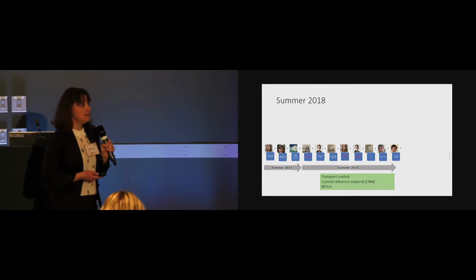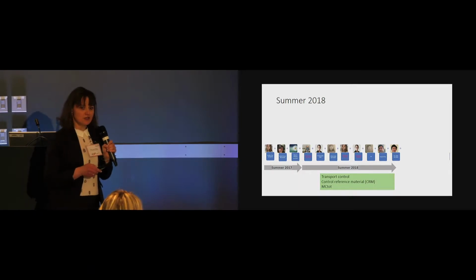We were handing in LODs and LOQs which were measured at every standard curve, and they determined LODs and LOQs for the method. So they are not fluctuating, they are not measured at every standard curve, which is good for you when you do analysis.